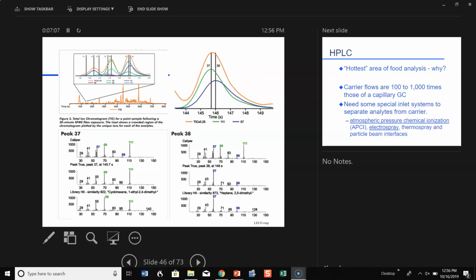This is one I think I showed you already, and it shows up here as well. I just want to make another point of that. If you could see this chromatogram here, there's tiny peaks, actually 3 tiny peaks of orange up here. Right here, this is the rest of my sample coming through. This is time, this is coming basically out of the gas chromatograph. And there's 3 tiny peaks. And you may be inclined to say, okay, there's 1, 2, 3 compounds.